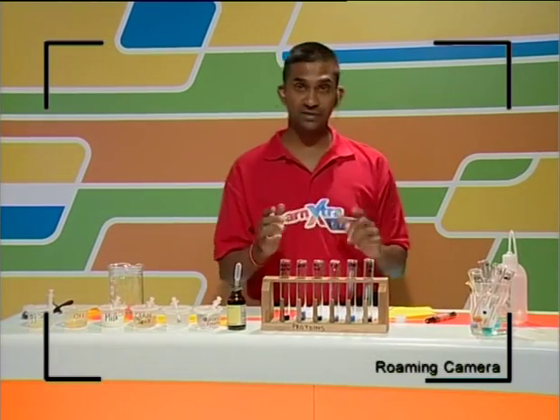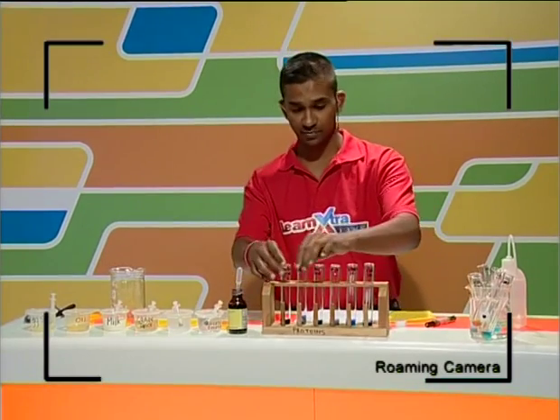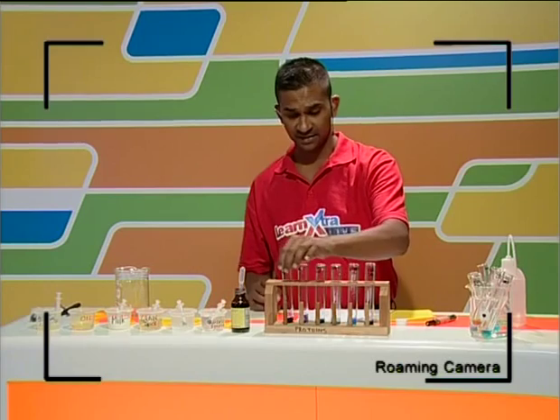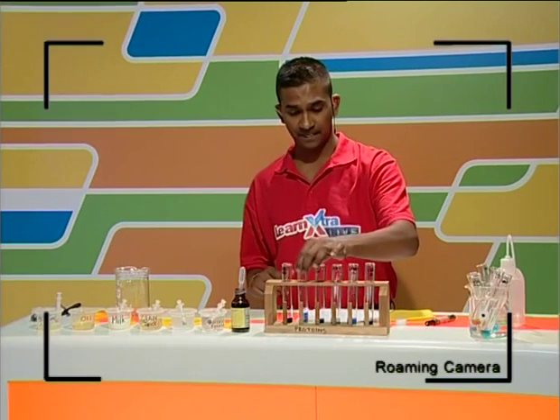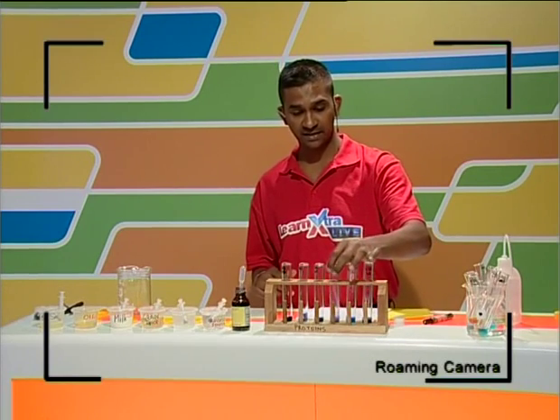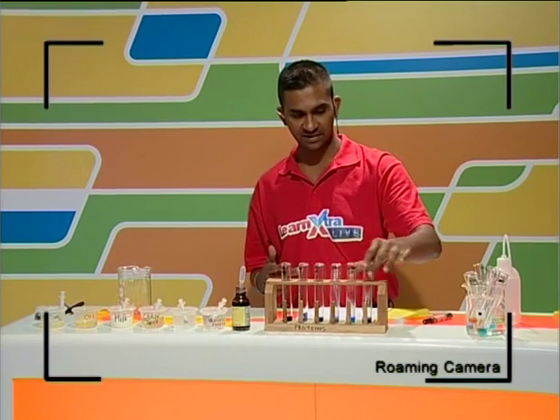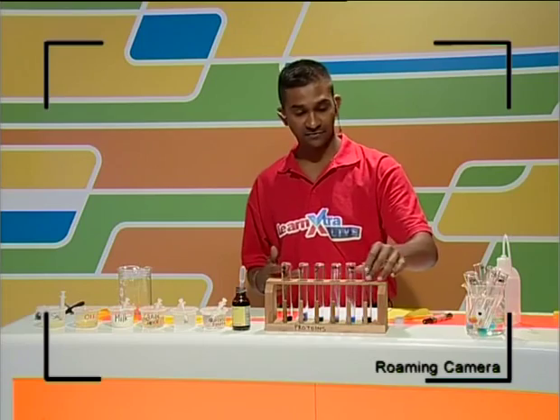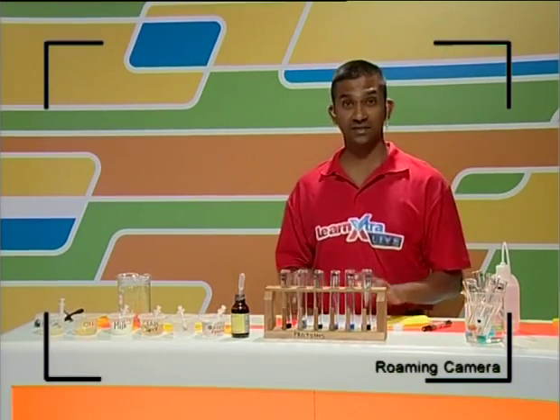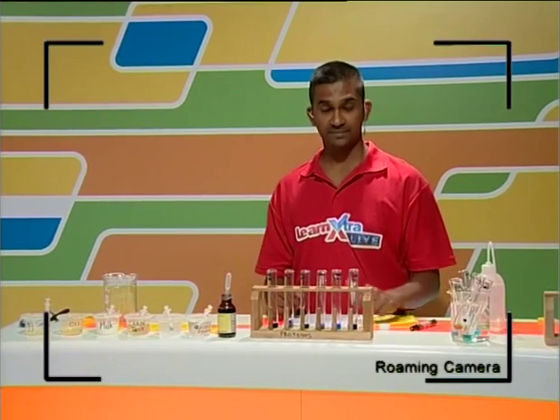So I'm going to again put these into a beaker. We actually don't need to do that, because here we clearly see reactions taking place. Fortunately for us, guys, today we don't need to stimulate the reaction by adding in heat. We've got results instantly, and I'm going to very quickly look at how much time we have for a break, and then probably we're going to look at and interpret these results when we get back.